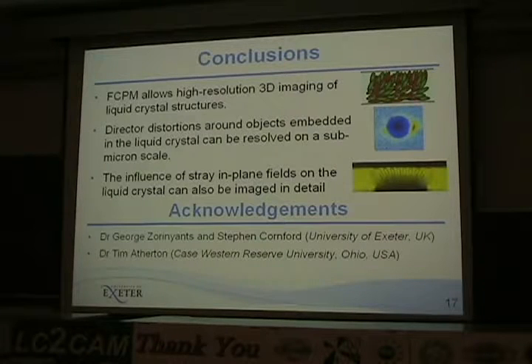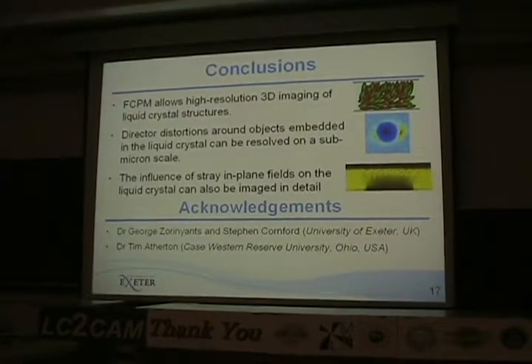So time for one more question. I was curious, I don't know how large the dielectric differences are at DC for these sorts of things, and I was wondering if you needed to take into account the director field in order to be able to calculate the electric field.